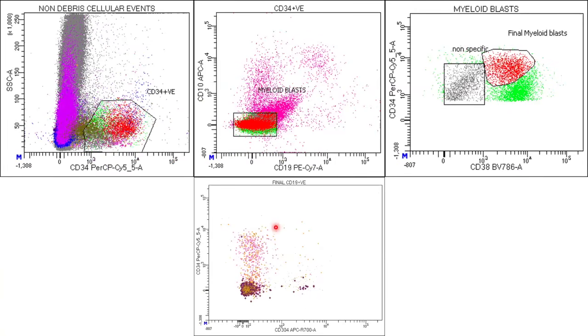So these are things that have to be mentioned in the MRD report. So that's why we are calculating these cells. So this is a case of classical normal B-ALL MRD, where we are seeing normal patterns of maturation, and there is no overexpression or no underexpression of any LAIP marker that we are seeing over here. Okay, so moving on to the next case.